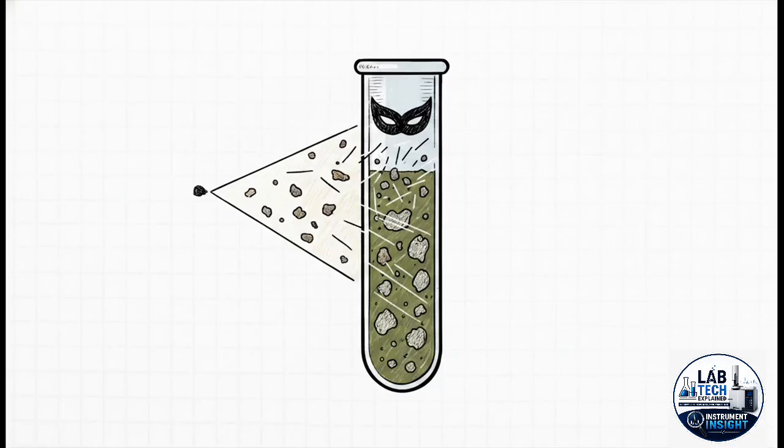As we move from abstract math into physical hardware, like the Macherey-Nagel NANOCOLOR devices, we've got to talk about the bad guy. Yes, I'm talking about turbidity. It is the unseen antagonist of water analysis. Basically, it's cloudiness. These tiny suspended particles scatter light and can completely sabotage our test results. And the crazy part?